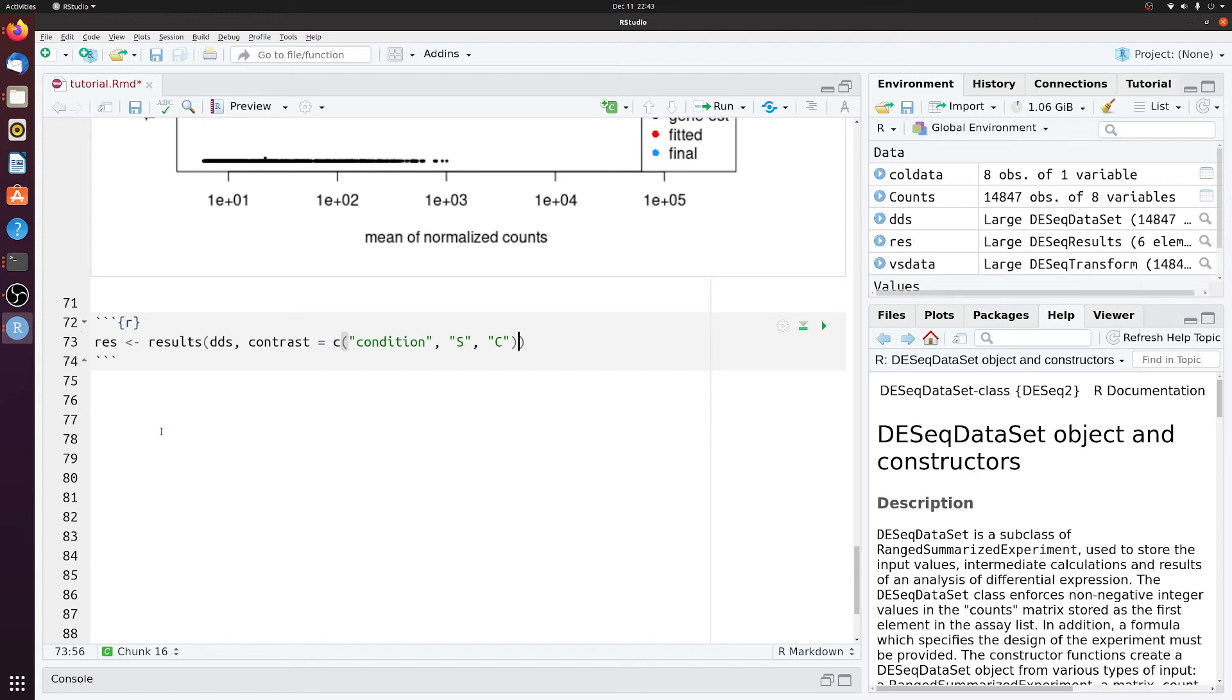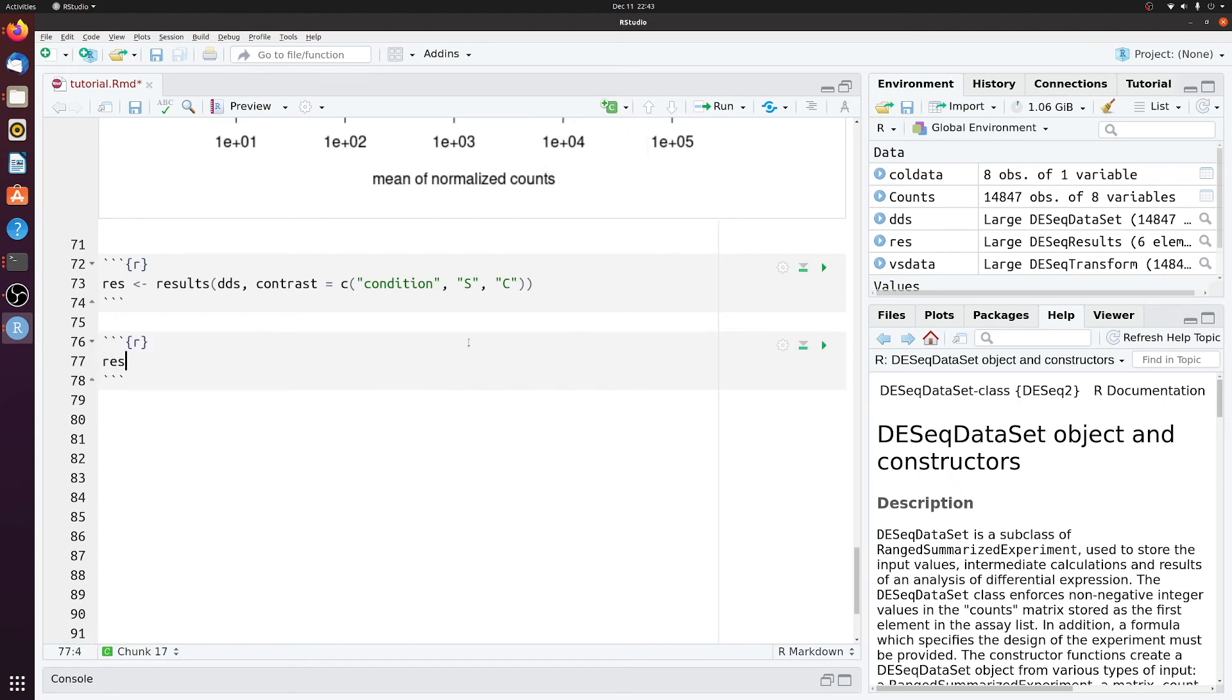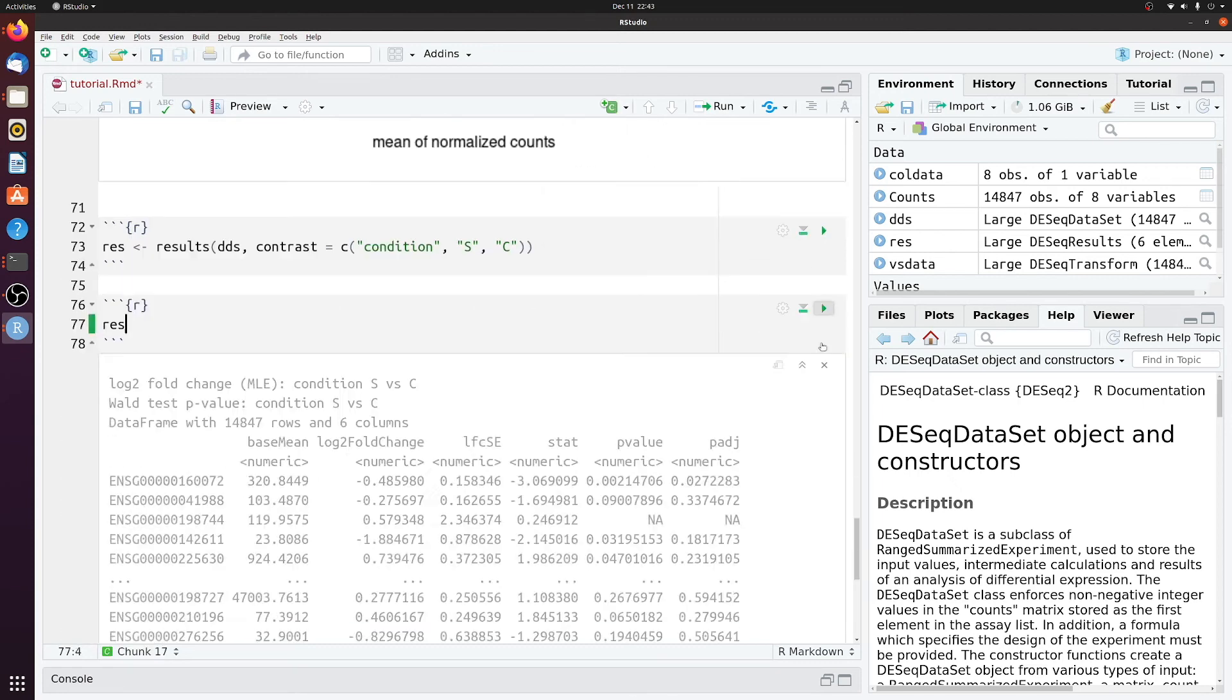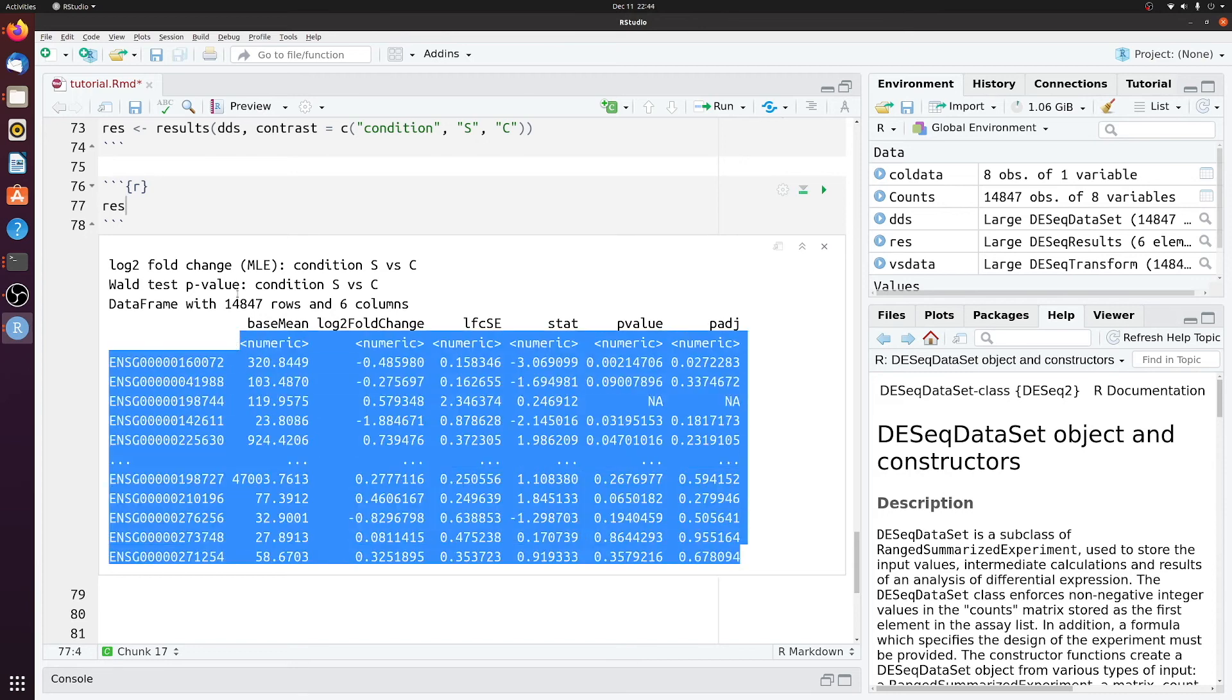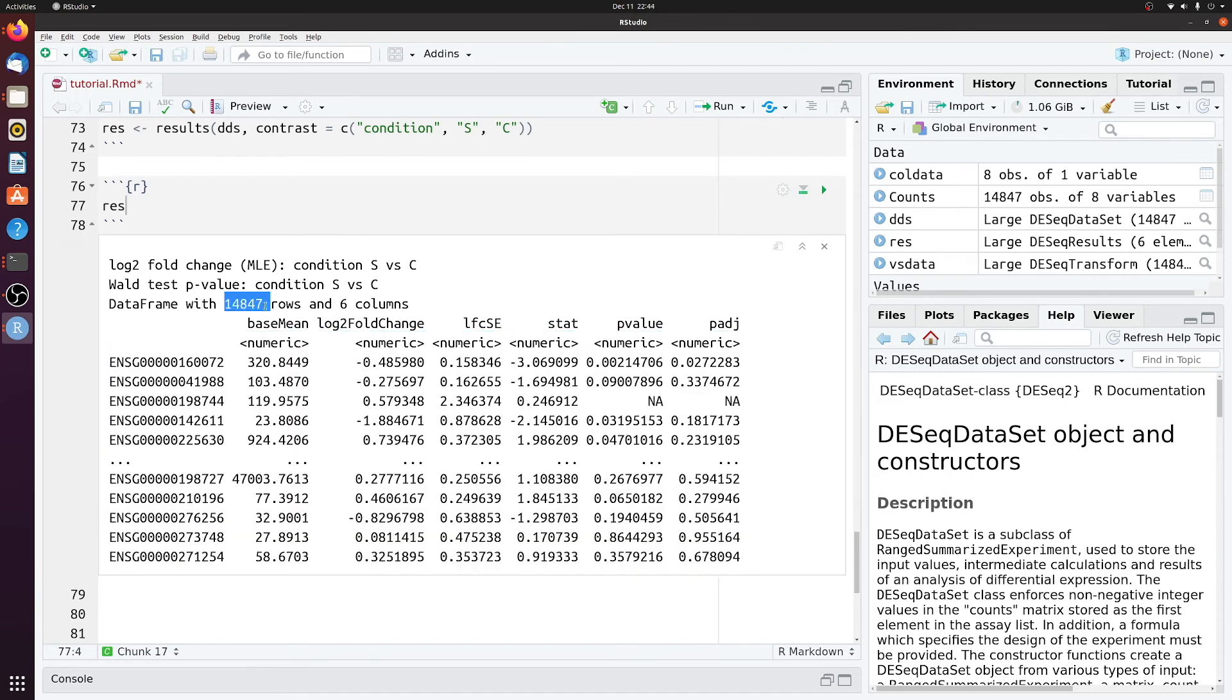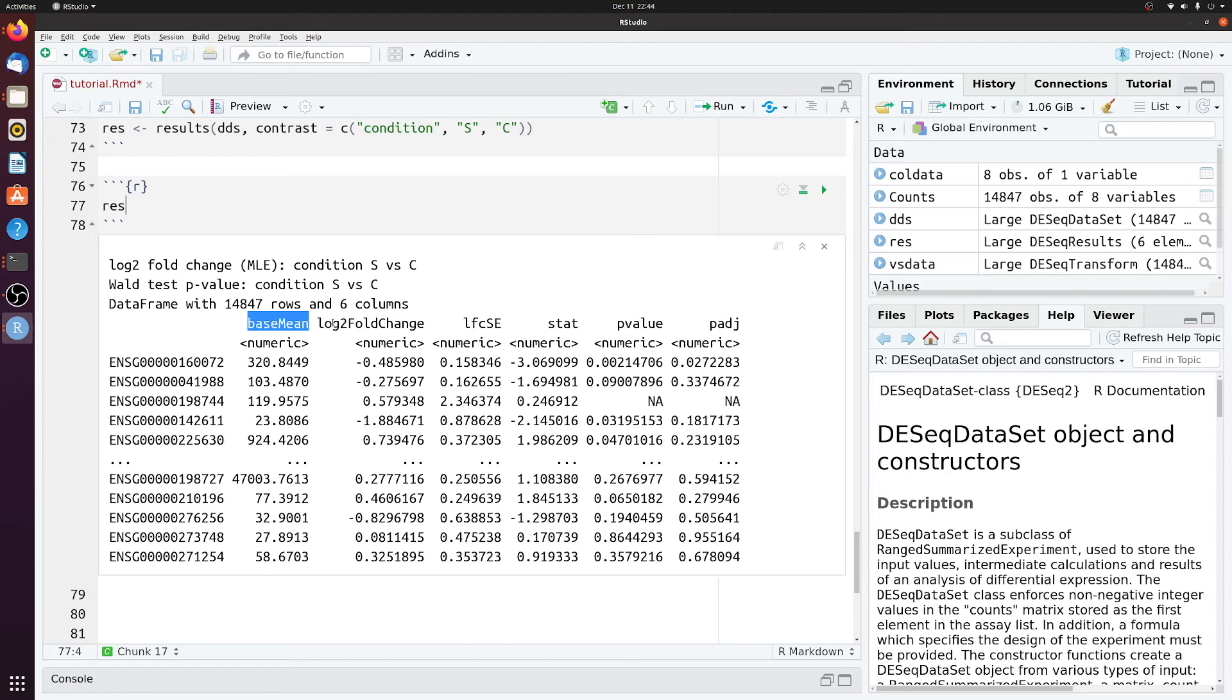Okay, so now we actually have the differentially expressed results. So if you look at res, we have this big table of all 14,000 genes. So the main things you want to pay attention to here, you can look at the mean. So the mean of that whole row, and then the log 2 fold change.